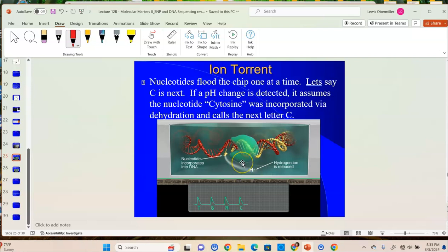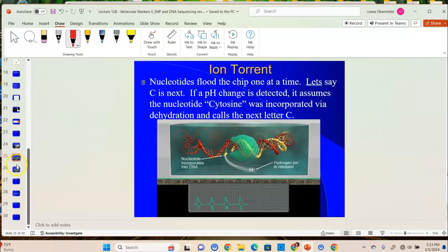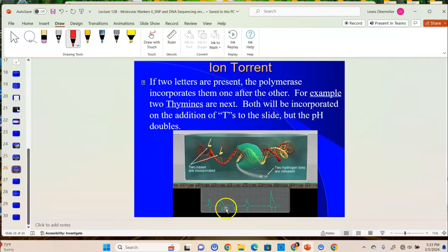released, and we know from, hopefully 181, that when we add hydrogens to a solution, it changes the pH, which we talked about. And so it's basically working by reading changes in pH, and it knows that if it puts a bunch of T's in there and there's no change in pH, then a T isn't incorporated. If there is a change in pH, we get a little peak, a variation, and it knows a T was incorporated. And then we put the other nucleotides in. And so when we get changes in pH, we know that that nucleotide has been incorporated. And if we have two T's in a row, we're going to get twice the pH change.